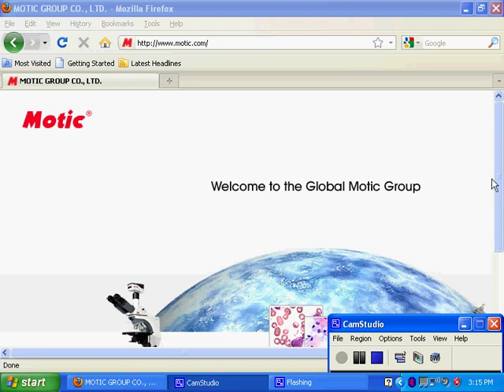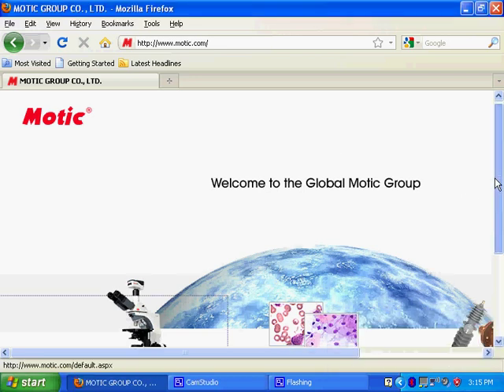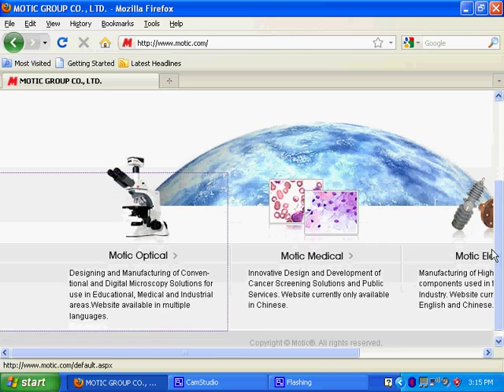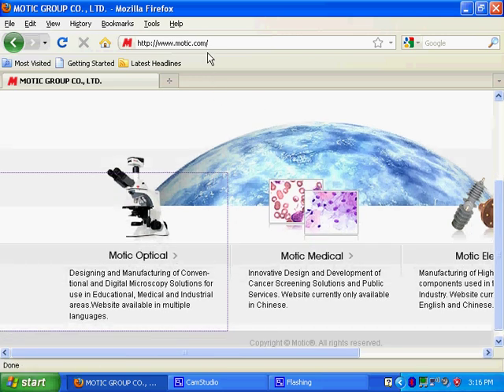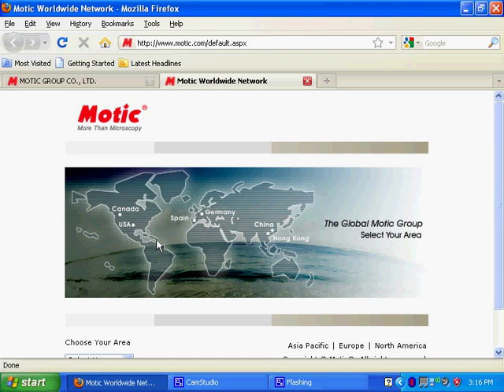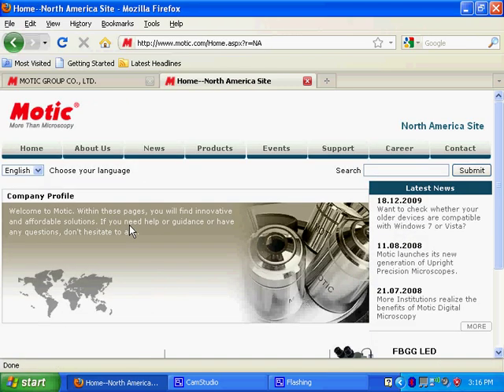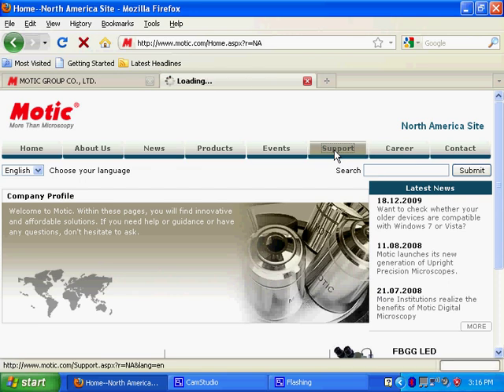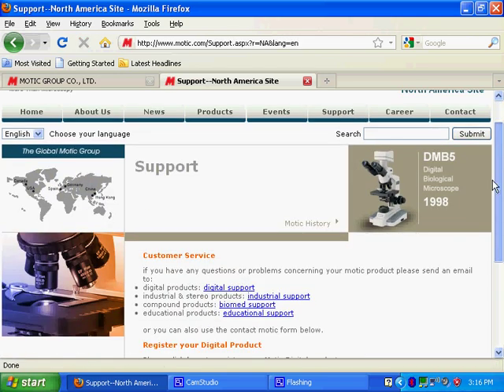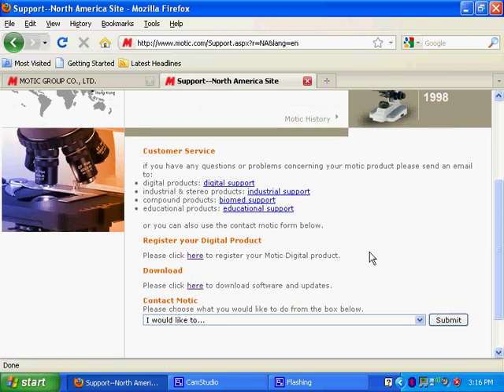I will show you right now where to exactly go to get your software. Once you reach www.motic.com, click on Motic Optical, then click on US, and then click on the Support tab, and then after that click on Downloads.